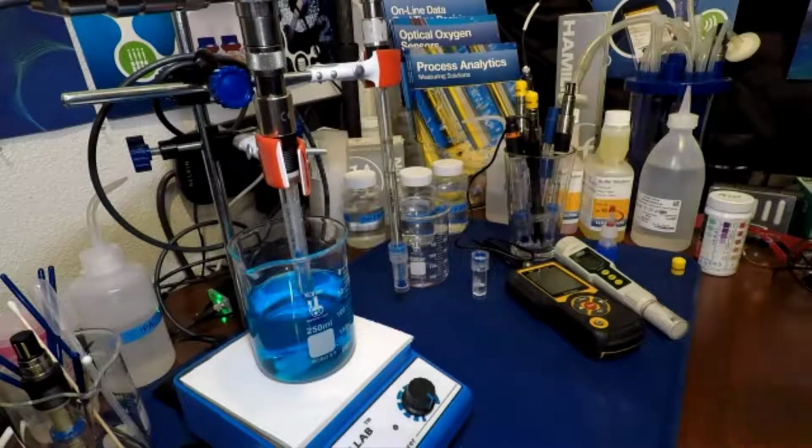In other industries, there are metal or plastic electrodes. There's also something called an ISFET, which is an ion selective field effect transistor. These are great, with the advantage of having no glass in them, so they should be ideal for the food industry. The problem with ISFET sensors is they cannot withstand hot alkaline CIP cleaning procedures. They also cannot be autoclaved or steamed in place, which is generally what you need for cleaning.